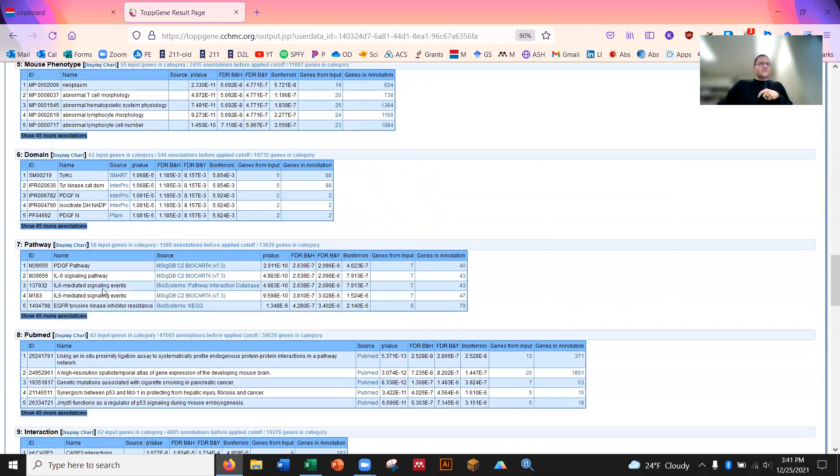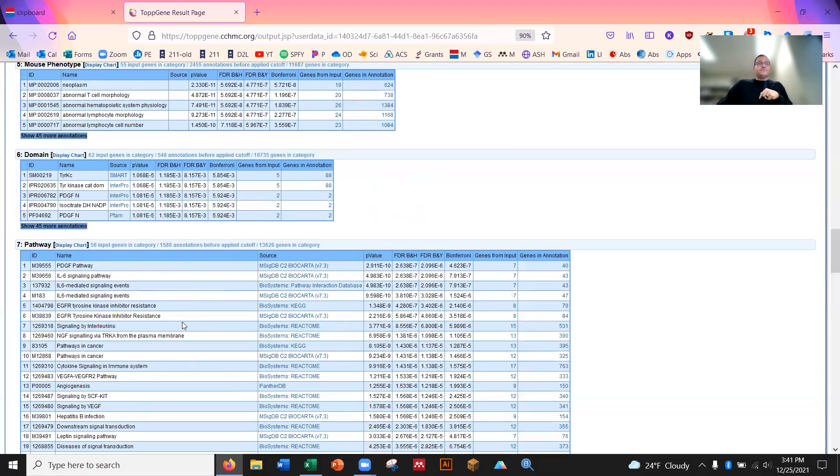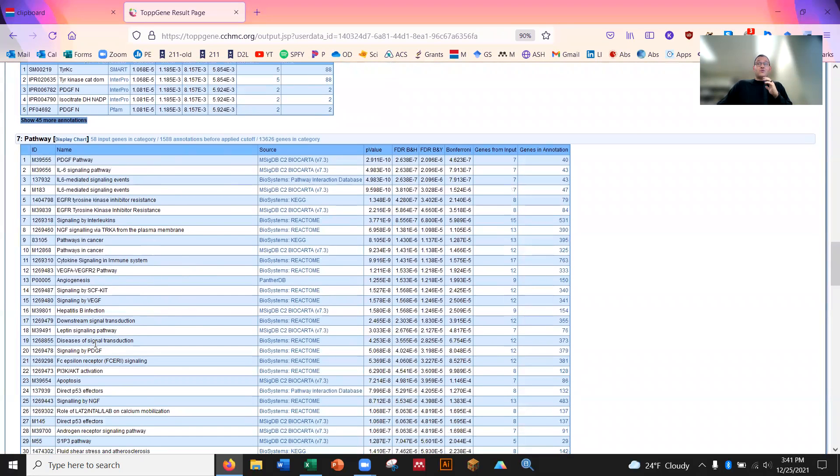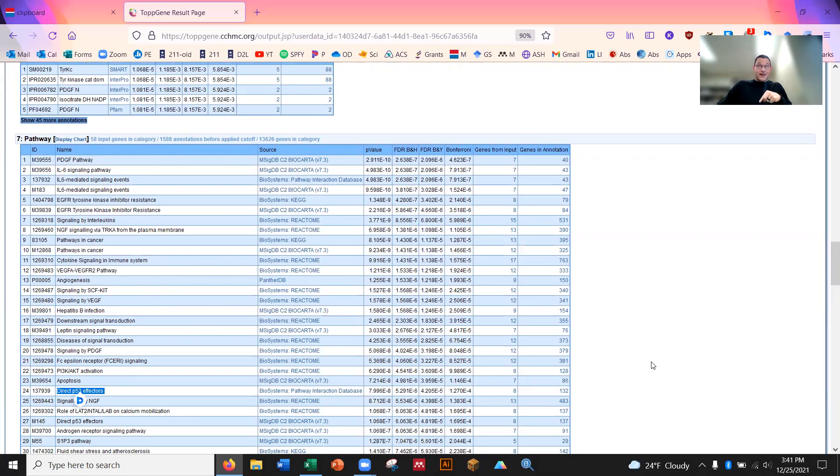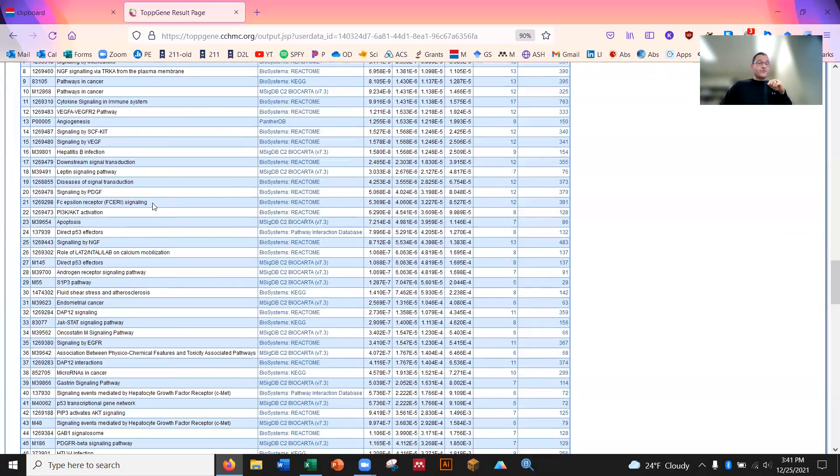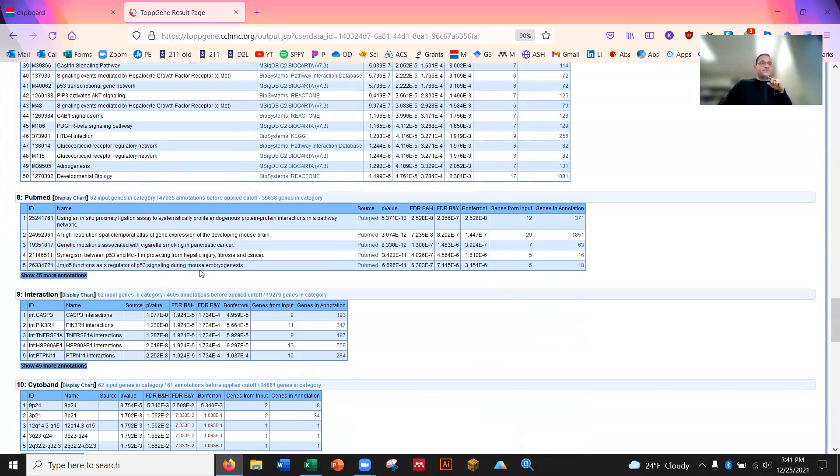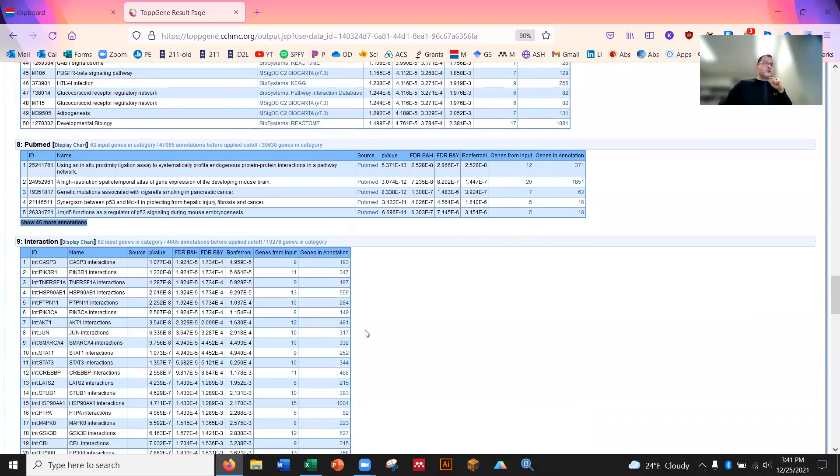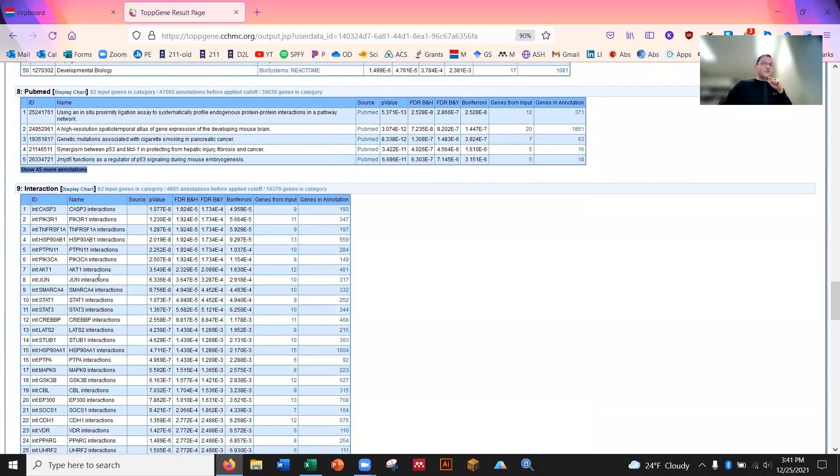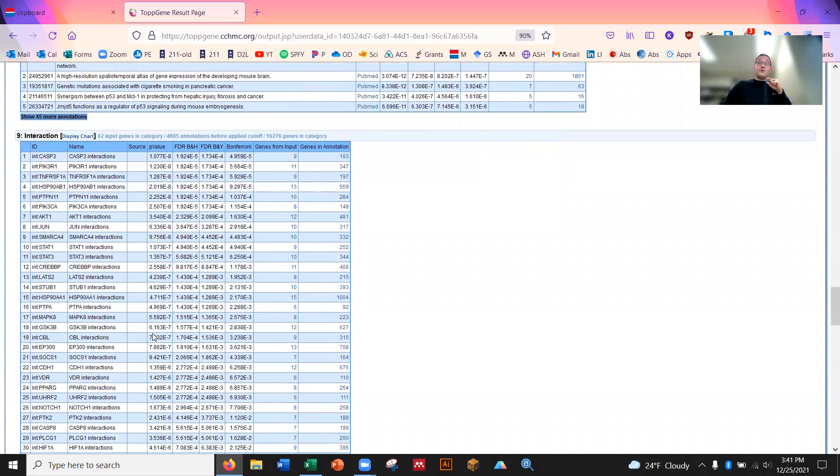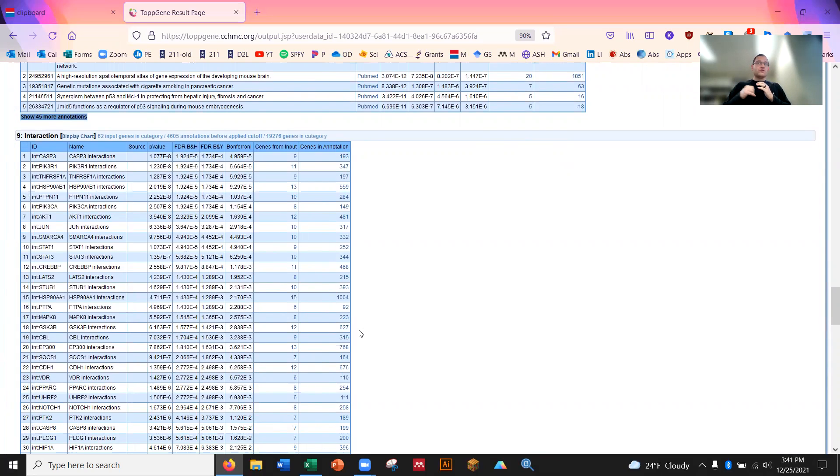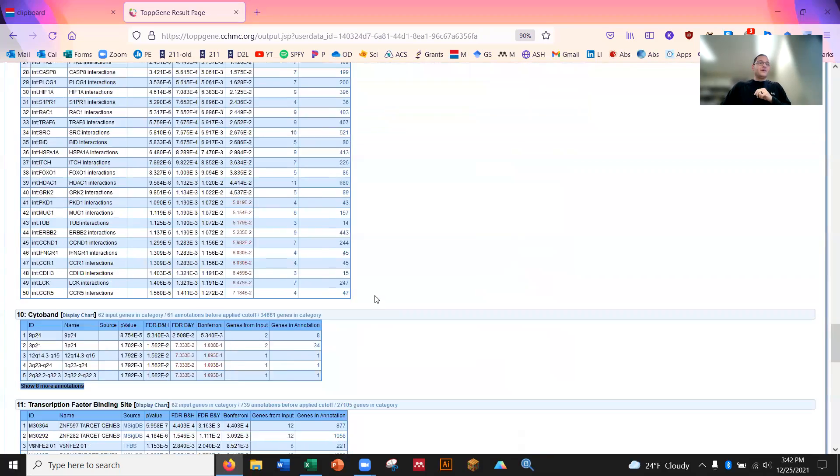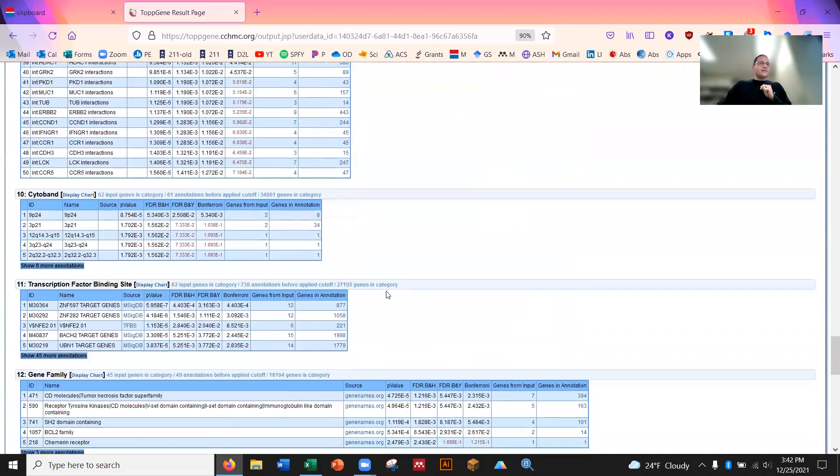So you can look through all these pieces right here, and you can see what exactly is going on in these tumors, and it makes the picture a lot more easy. You can see where a lot of this is happening. You can see some human phenotypes. Usually it's good to see a sanity check, for example, like we just did a major lymphoma mutation, and yeah, first phenotype that shows up with the genes that are bad, hematological neoplasm. That's us. Domain's a little advanced, I wouldn't worry. Pathway's a very good one. Pathway can show you exactly what's going on. Again, sanity check right here. P53 affecting proteins all down after the mutation. Pretty big deal. IL-6, that's a big immune signaler. It's actually a pretty good insight right there. Interactions is another very good one, because again, you can take these genes and say, oh wow, it looks like these genes sort of had a larger role, or maybe, no, their role is diminished as well because their interactants went down. Kind of cool stuff.